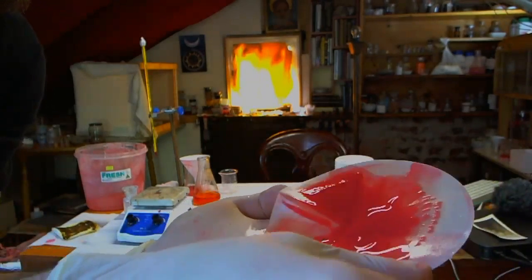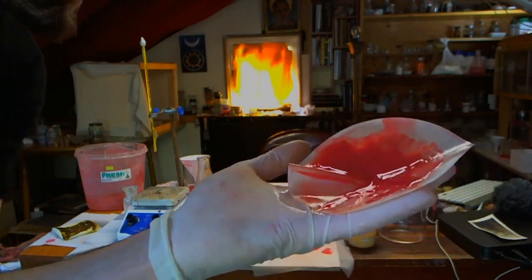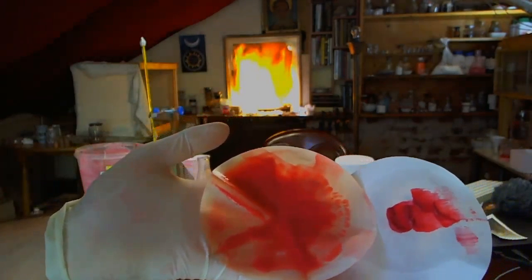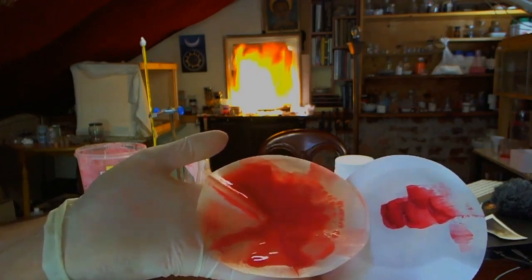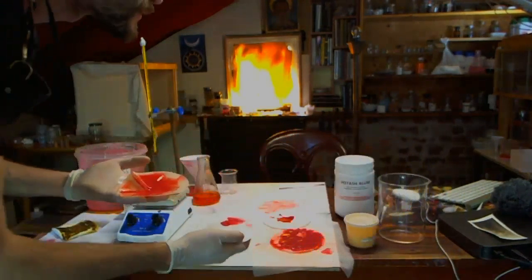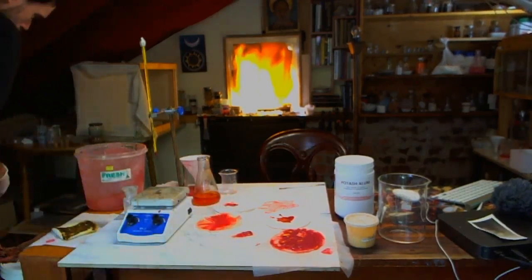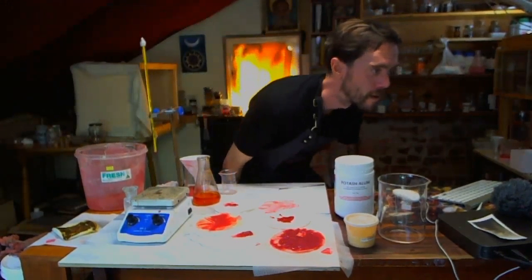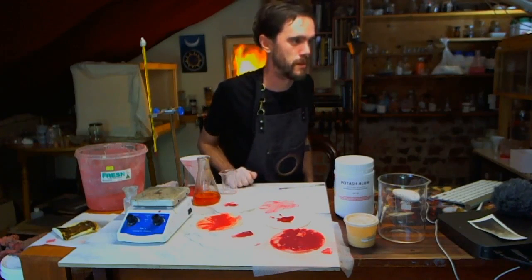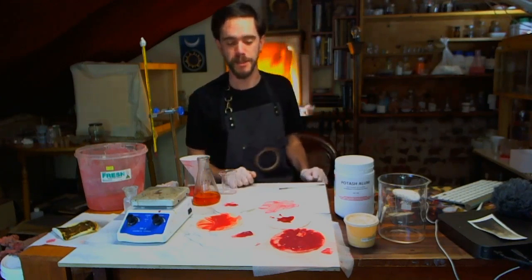It's pretty good, and for no sodium carbonate being added, this is really interesting that we have this pigment. So that's the red that we got from the cotton wool, and they're obviously miles apart in color intensity. So we definitely messed something up slightly in that process. Plus, consider that you didn't ferment the solution for a week like it's supposed to. Yes, I didn't.